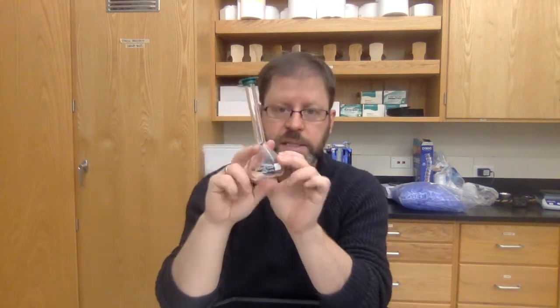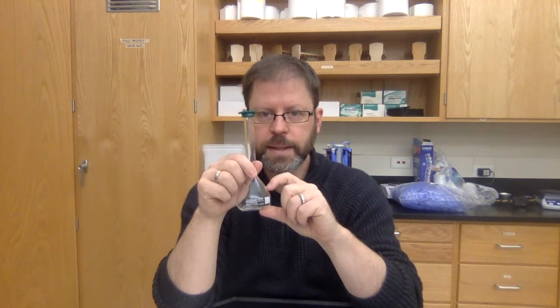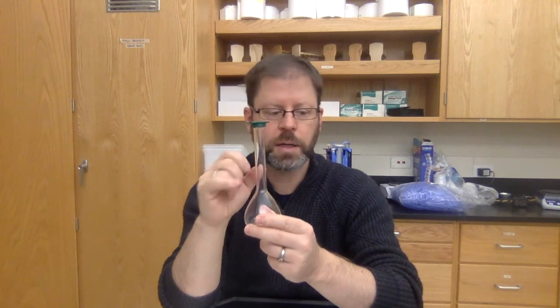Vitamin C is highly soluble, and so you're going to be putting some amount of that you need to determine, some mass of the tablet, a fraction of it, into something like this. And use your good lab practice. Remember, you would put in the powder, then you would fill up a fraction of the way, stir it around, and then you can fill to the mark.